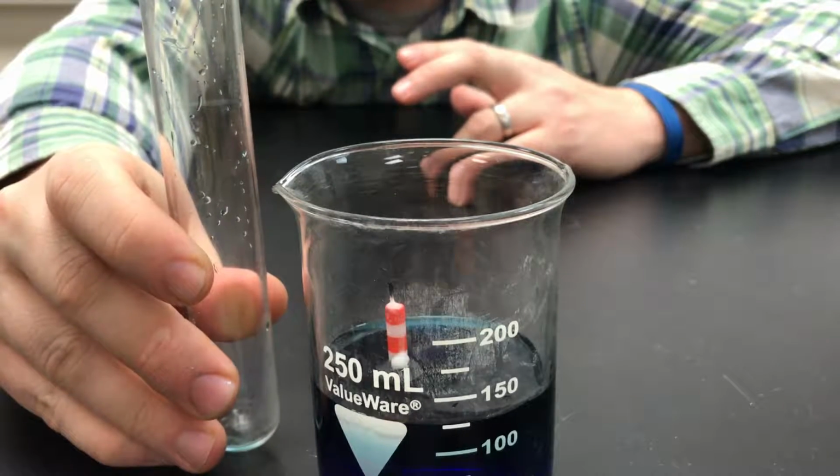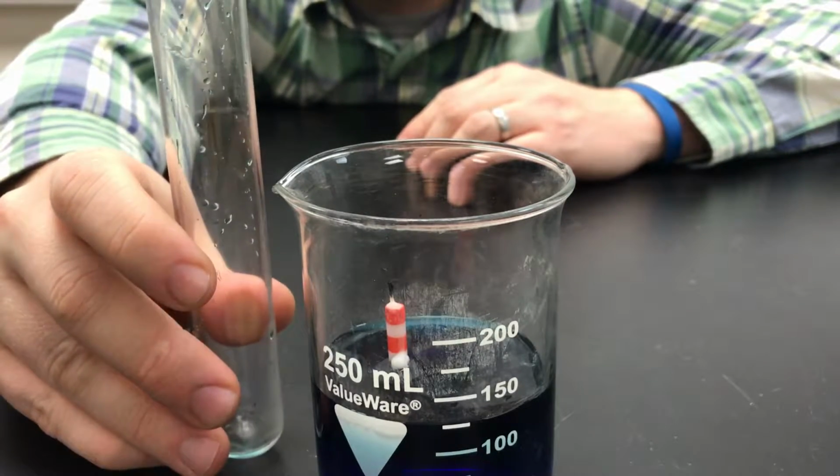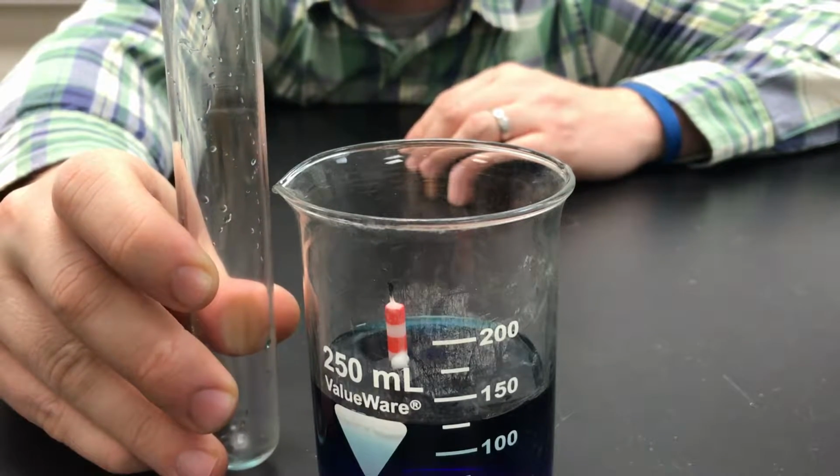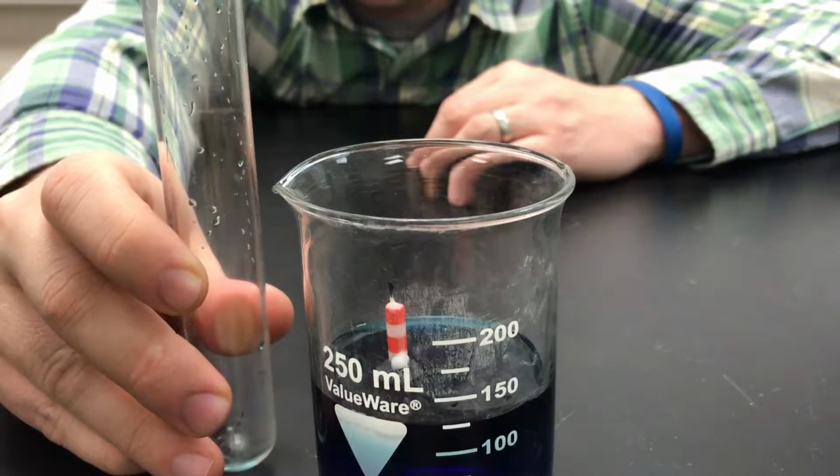Now I've already measured the volume of the test tube by pouring in water, pouring it out into a graduated cylinder. That volume of water also represents the volume of air. So I know the volume of the air with the oxygen in it. What I want to do is take the oxygen out of the air.